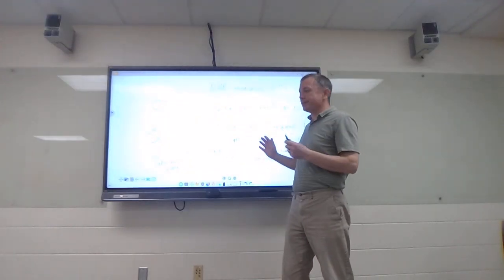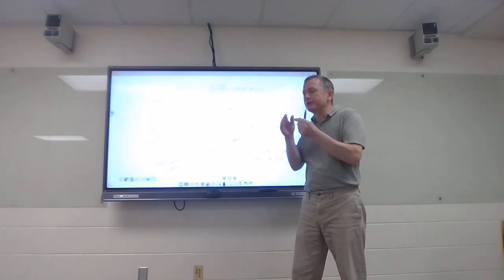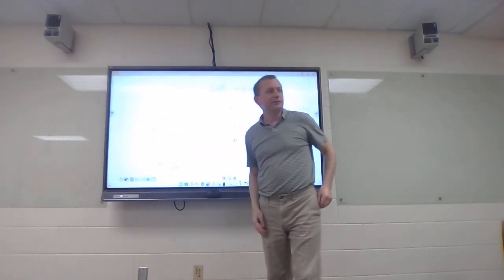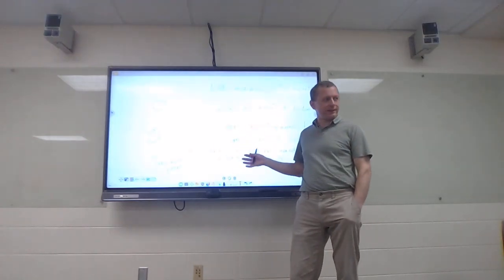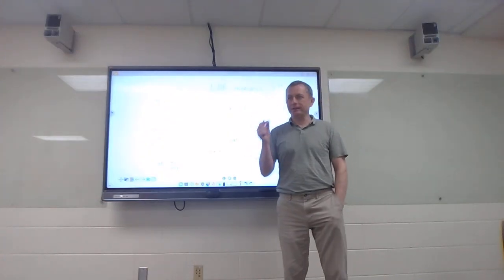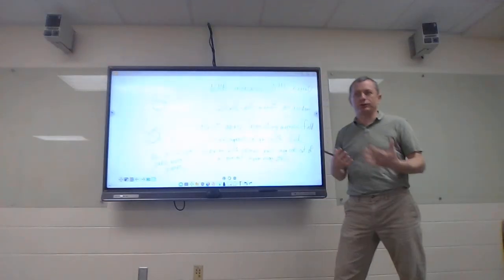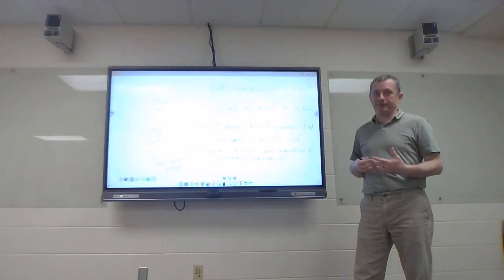And so they're not seeing peaks, but they can see intensity in certain ranges, which is then translated into color, image, three-dimensional. I don't know exactly how that technology works, but it's the same basic idea of a large magnetic field: pulse that thing, measure the radio waves and the intensity of that radio wave in certain frequencies, and they're able to generate an image from that without necessarily seeing particular atoms.